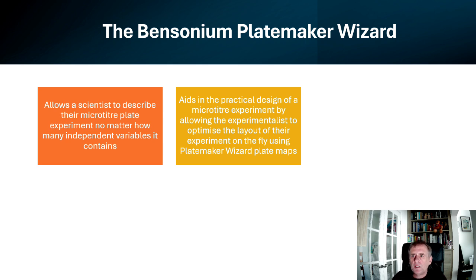As you'll know if you're a biologist, sometimes actually designing complicated plate layouts for microtiter plates can also be time consuming, and often being able to visualize quickly a different layout can be very helpful.